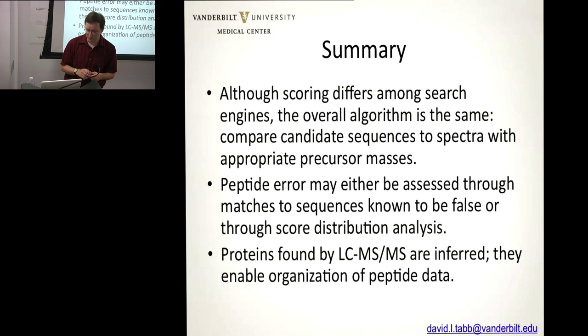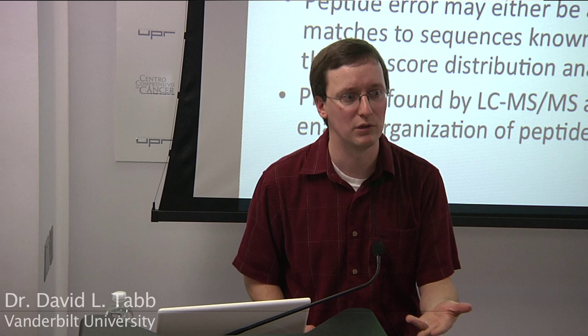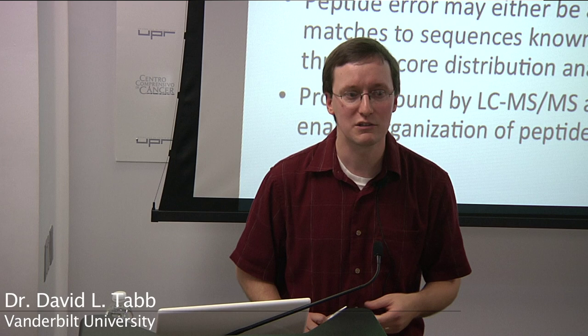And the other thing to really keep in mind is that proteins are inferential. Because we're digesting our samples at the very start, the protein list is inferred from peptide evidence. So in that way, if you want to know much more directly what's going on in your sample, looking at the peptides you see is actually much closer to the data that we're actually collecting. It's worth keeping that in mind whenever you're looking at a protein list that comes from these.